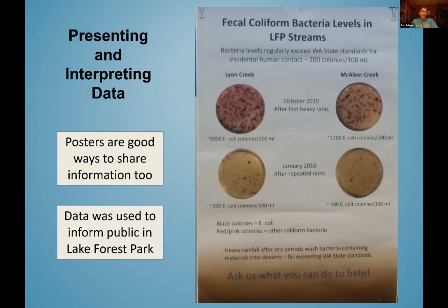Well, you're supposed to count after you've let it incubate for the given period. So 30 to 48 hours, you want to count it in that window. But I've had dishes that sat around for a while after the fact, and they don't change color again. They just continue to grow.